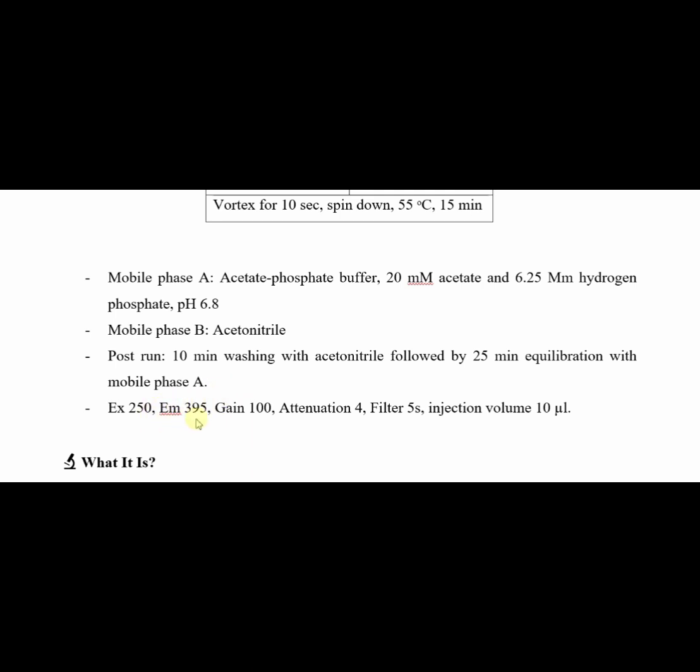Excitation 250 nanometer, emission 395 nanometer. Gain used was 100. Attenuation 4, filter 5 seconds. Injection volume was 10 microliter.